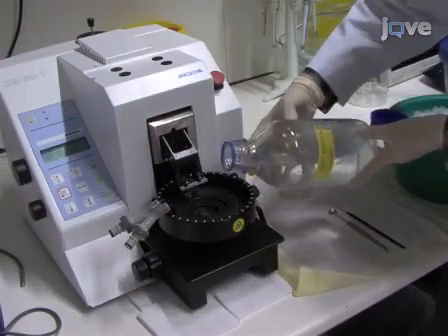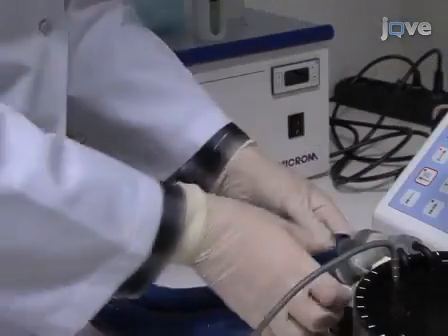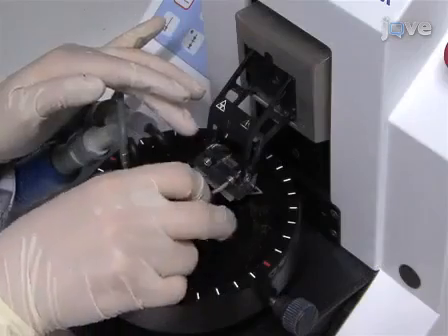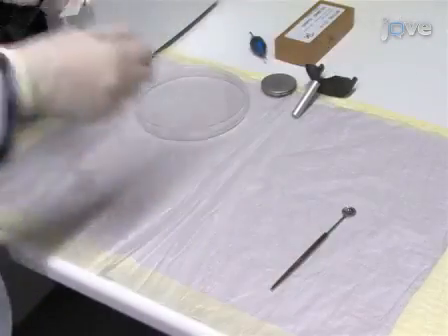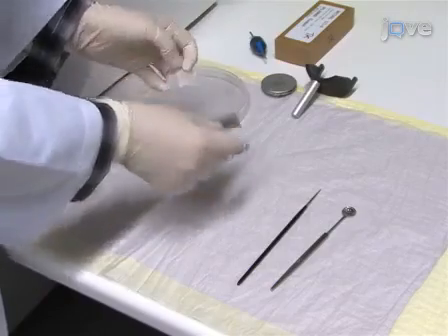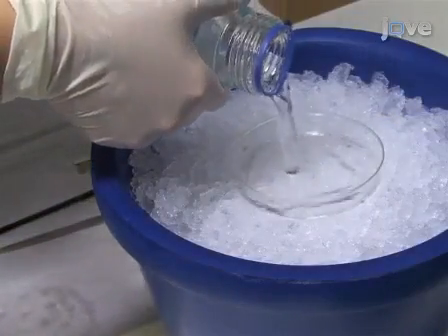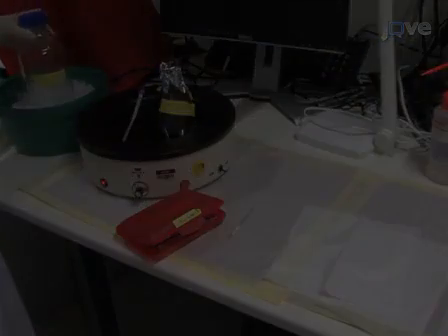Next, fill up the vibratome buffer tray with ice-cold Krebs buffer. Turn the cooling element on and keep it at 4 degrees Celsius. After that, fix a razor blade in the blade carrier. Prepare a scalpel, a fine paintbrush, and a mini perforated spoon for picking up the slices in the vibratome area for later sectioning. Then add Krebs buffer to the sterile petri dishes and keep them on ice.